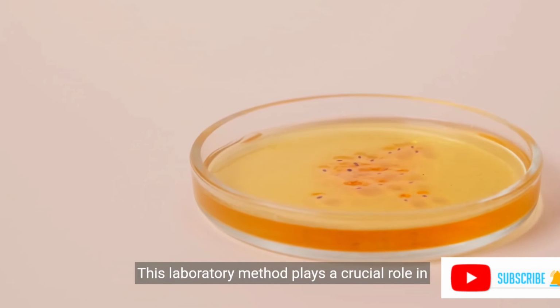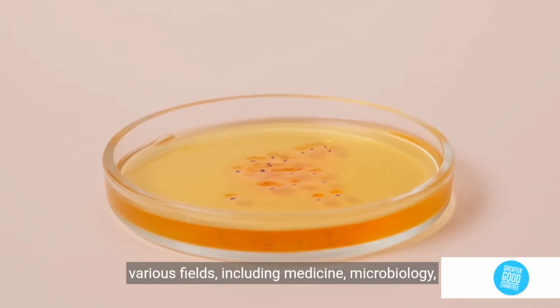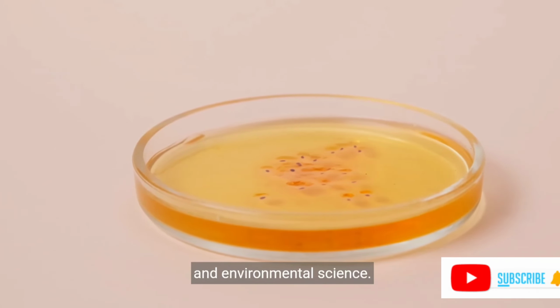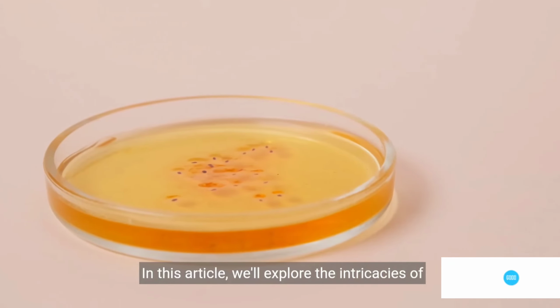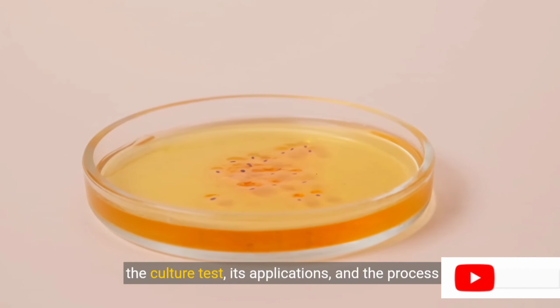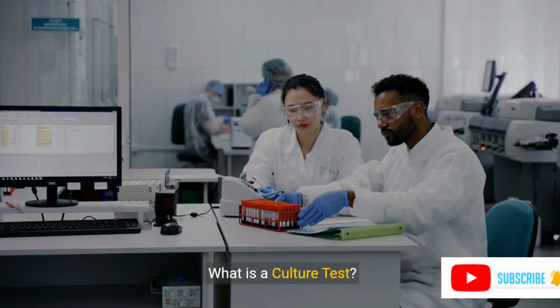This laboratory method plays a crucial role in various fields, including medicine, microbiology, and environmental science. In this article, we'll explore the intricacies of the culture test, its applications, and the process involved. What is a culture test?